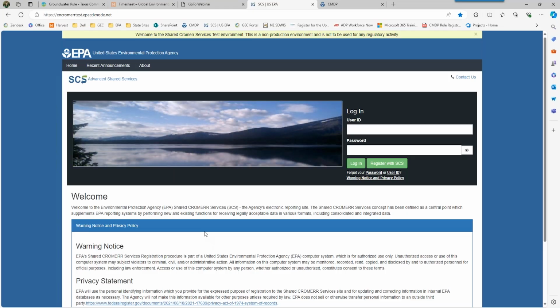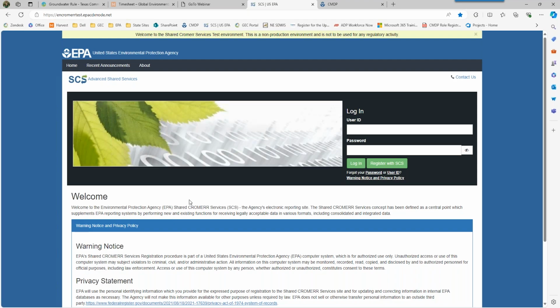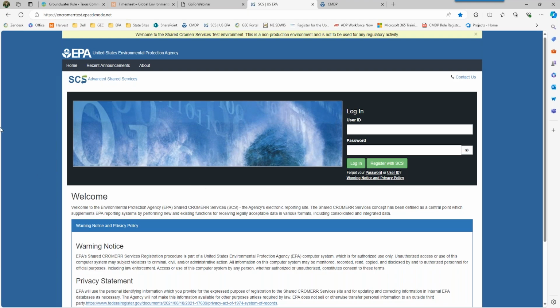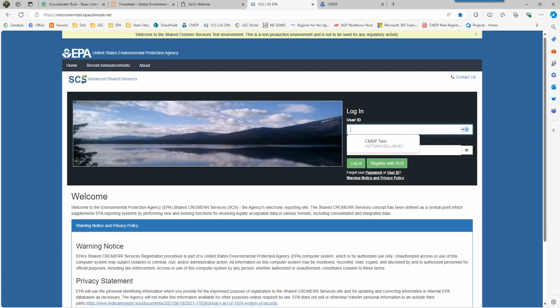All right, can everybody see my screen here, the EPA SCS page? Yes, we can see it. Perfect. Okay, so I am going to start by logging in. So this is our EPA SCS page, and I'm going to log in here as if I am an administrator that can send registrations.